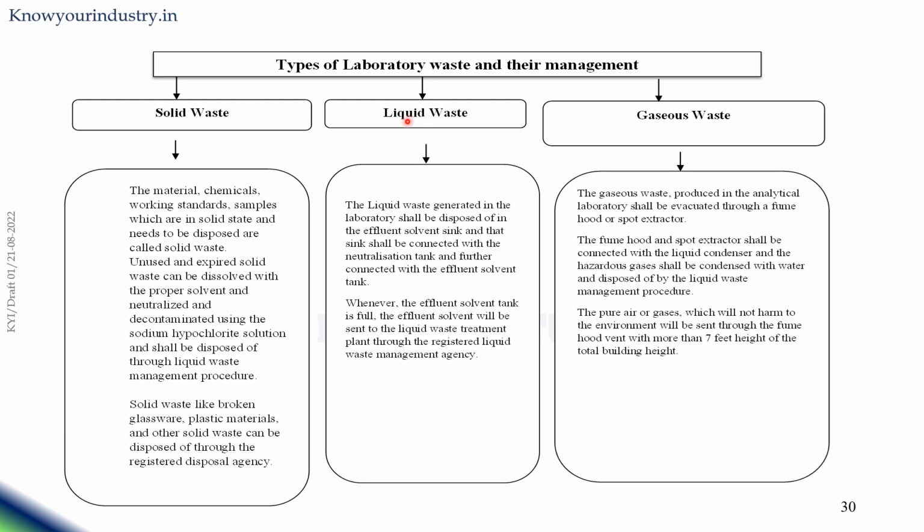So this entire waste management system can be handled through an external party, or a laboratory can have an in-house infrastructure to handle this waste management.